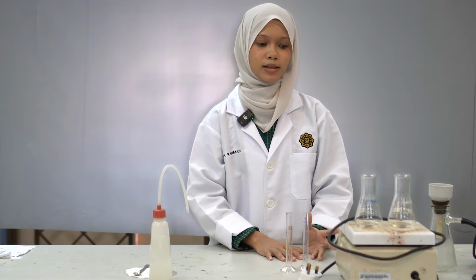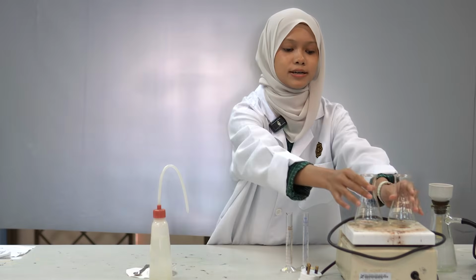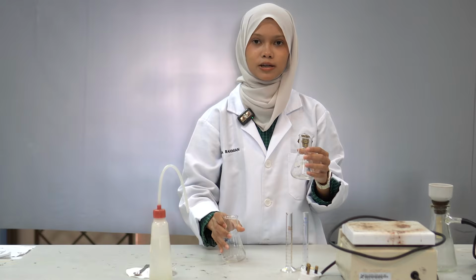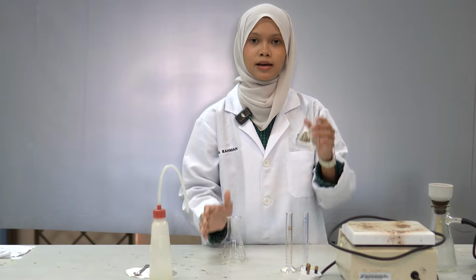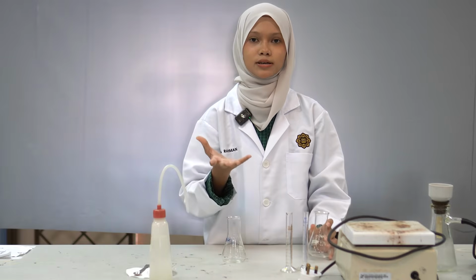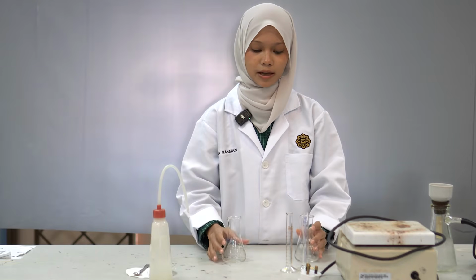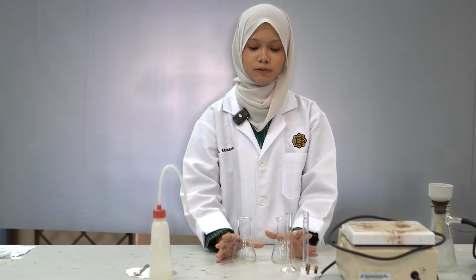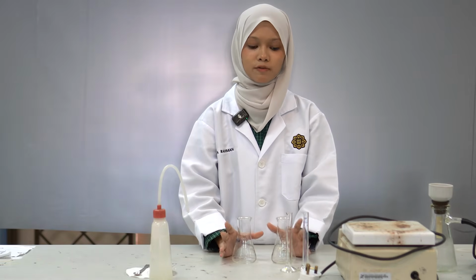Once it boils and dissolves, we're going to cool it down. For the single solvent flask, we're going to use only room temperature to cool it down, and for the mixed solvent flask, we're going to immerse it in the ice water bath. Then we wait for a few minutes, and we're going to observe what happened in both of our flasks.